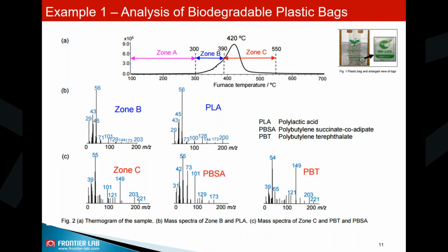Here I show an example of the analysis of biodegradable plastic bags. Okay, so as you know, in the market now, people are trying to introduce biodegradable plastic bags, for which sometimes we are paying a higher price. So it's important to understand how the chemistry of these compares to the synthetic polymer bag.